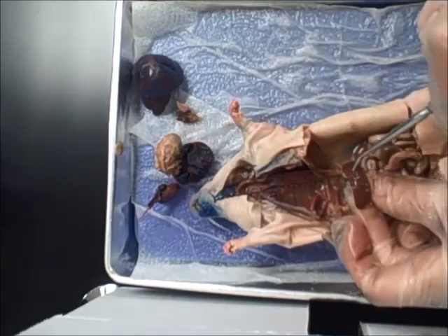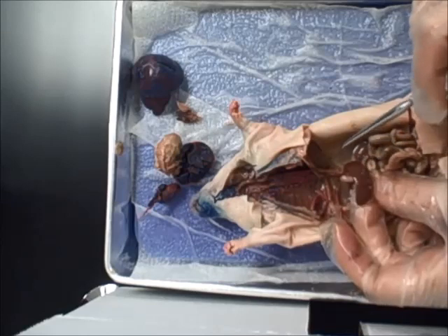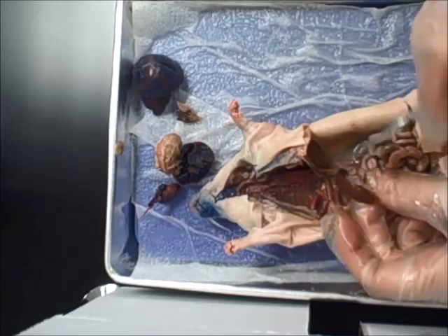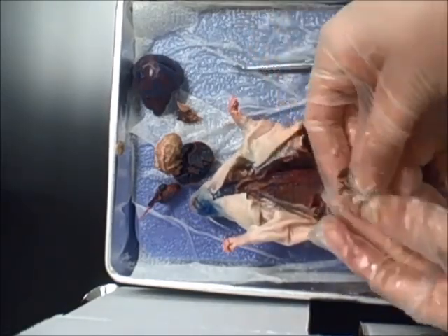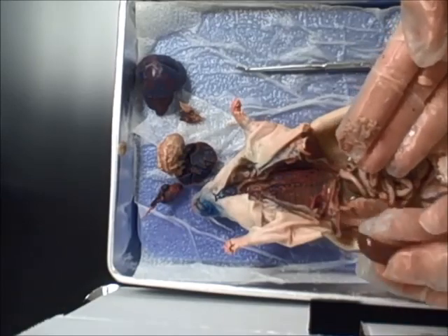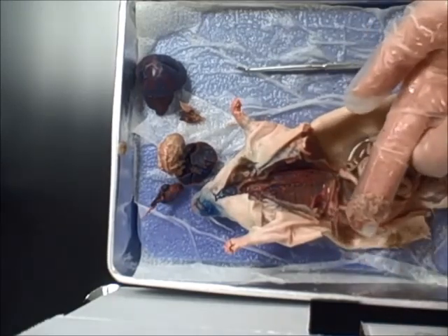It functions in the immune system, functions to clean out the old blood cells, and also to help clean out pathogens. Underneath the spleen, kind of looks like chewed up gum. This is the pancreas. So there's the pancreas right there. So spleen, part of the immune system, pancreas, part of the digestive system.